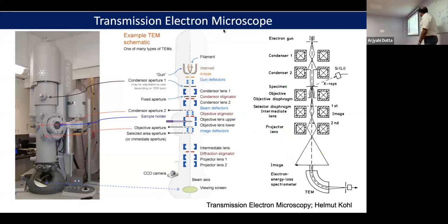Okay, so this is the same microscope where you can see all the details. Here you can see multiple knobs. The aperture as well as the lens system is connected here. So those are the old setups. That's why you can see all of these things and you can control them manually. In most recent microscopes, you will not get this kind of thing at all. Everything is controlled by computer. And yeah, definitely one thing is that when you can do something manually, you have more control.